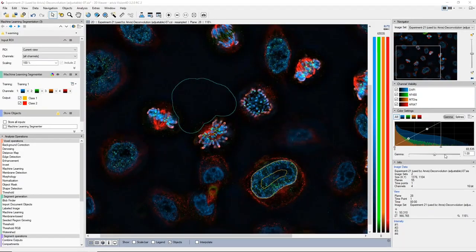If you have an image where maybe you have a staining that is expressed really strongly in your nucleus and is then very diffuse in the rest of the cytoplasm, then maybe you can use the blob finder first to detect the nuclei, and then you can use a region growing to grow to the edge of the cell by using the diffuse staining in the cytoplasm. So yes, you can do this region growing on one channel if necessary. In most cases, it makes more sense to have two separate channels, but certainly you can use one channel for both.